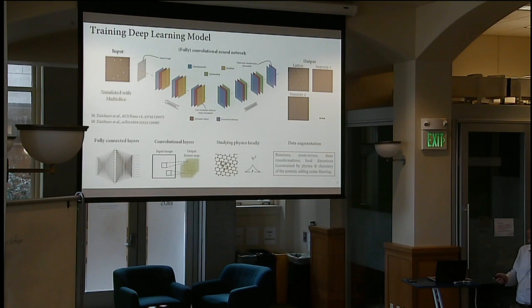or defect. Okay, so this is your input. For electron microscopy data, you get it from simulating how electrons scatter from atomic nuclei. And so this is your ground truth. You don't simulate the whole training set with this multi-slice algorithm. You actually simulate dozens of images, and then you do data augmentation. And you don't do it randomly. You actually do it to account for certain instrumental factors as well as uncertainty in your model.